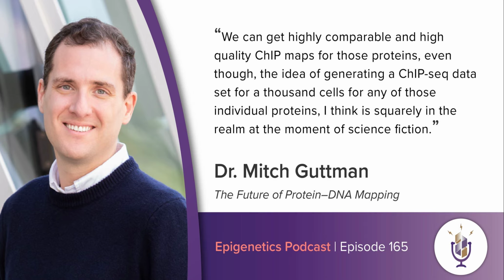And the second is being able to do a pooled ChIP, and to be able to resolve each of those beads to individual chromatin molecules. Because, of course, doing a pooled ChIP in and of itself doesn't really buy you much. It just buys you a big cacophony mess unless you can resolve it. And that's where the split pool provides a lot of value, in being able to resolve them.